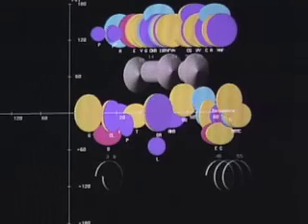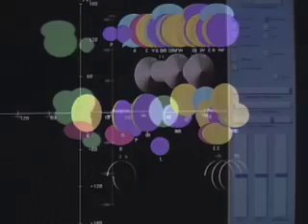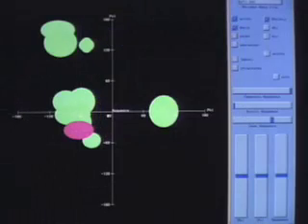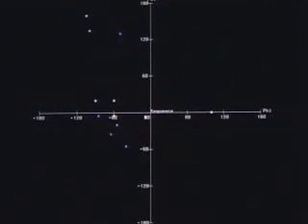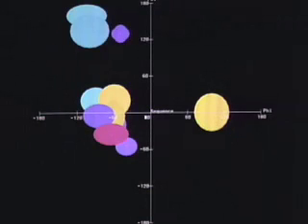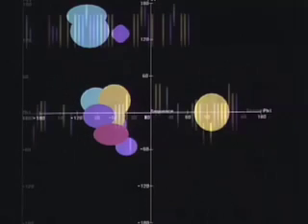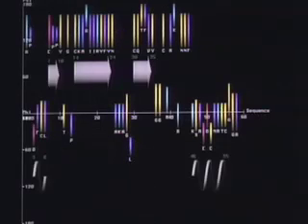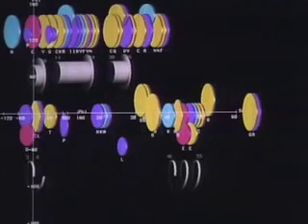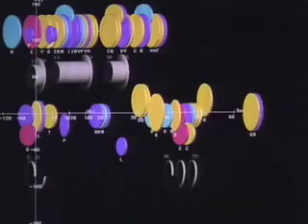The next-generation version of our buildup strategy will be on a Silicon Graphics workstation, taking advantage of its effective three-dimensional visualization. The backbone conformation is displayed as an ellipsoid. The coordinates of the center of the ellipsoid represent the mathematical expectations for Phi and Psi, while the axes show the standard deviations. The colors indicate the polarity and charged nature of the individual amino acid residues.